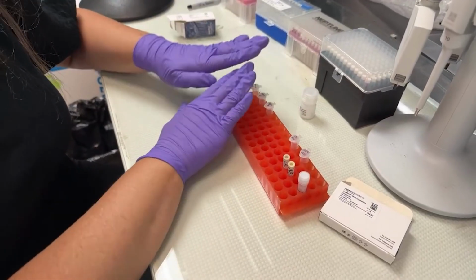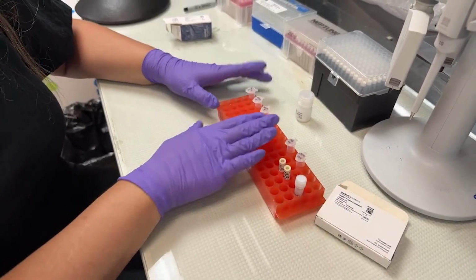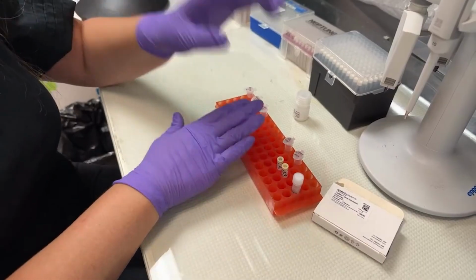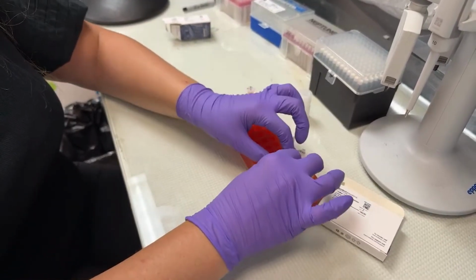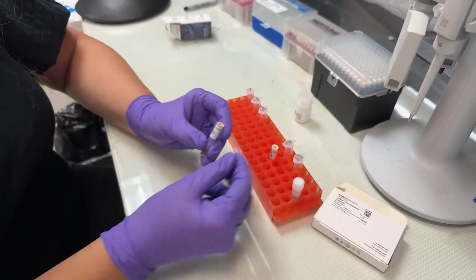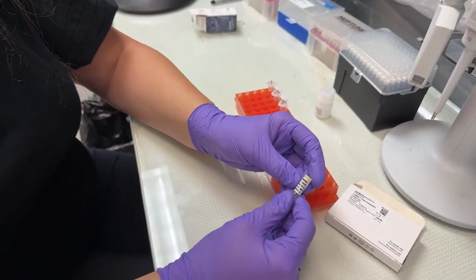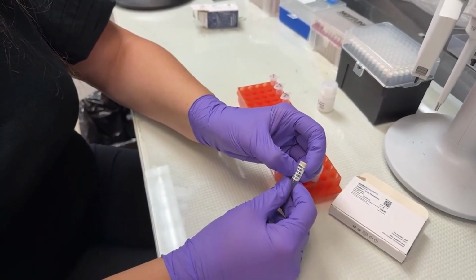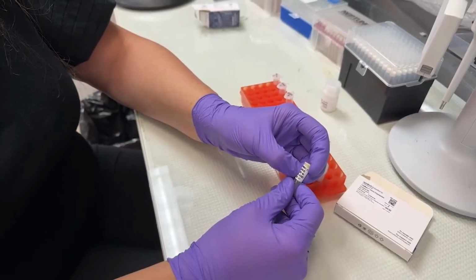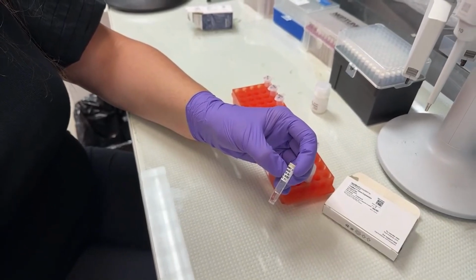So, I have 3 samples prepared from our original stock solution, and we're going to have a 4th no template control. So I'm going to go ahead and make each of these, double checking that the assay matches what I have listed on my tube. This is provided at a 20x concentration, meaning for each individual 10 microliter reaction, we're going to use 0.5 microliters of this material.